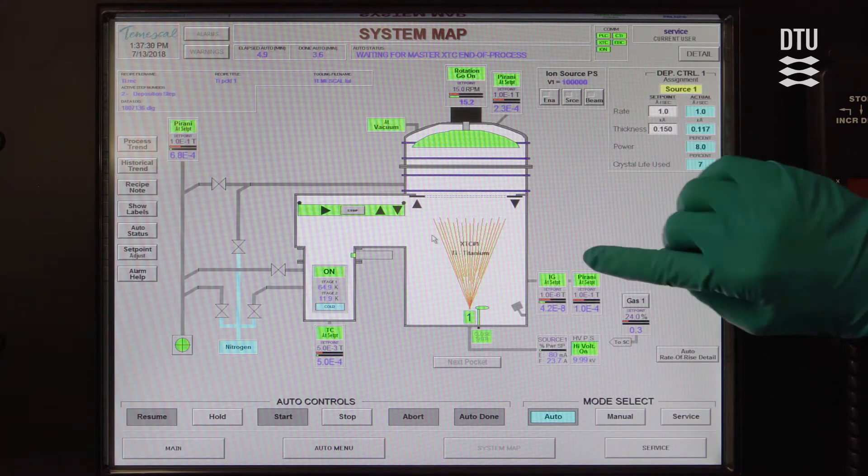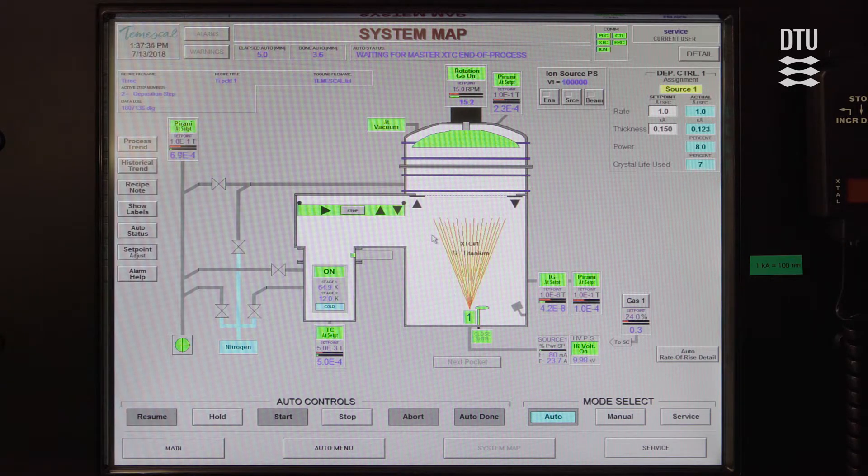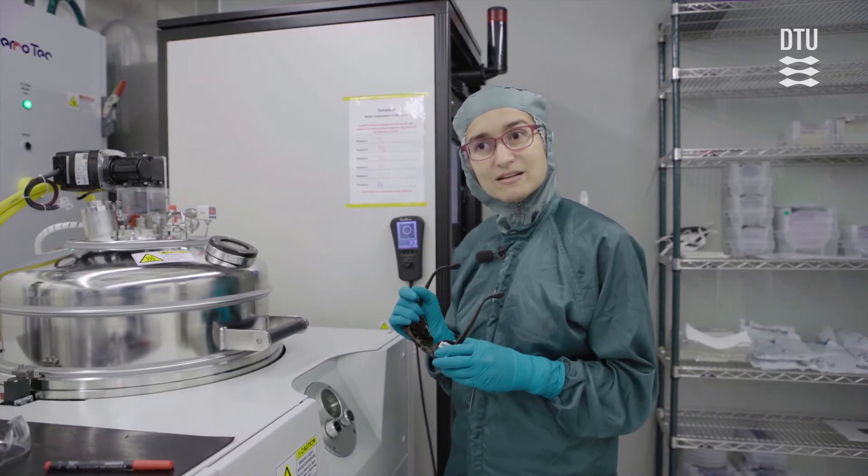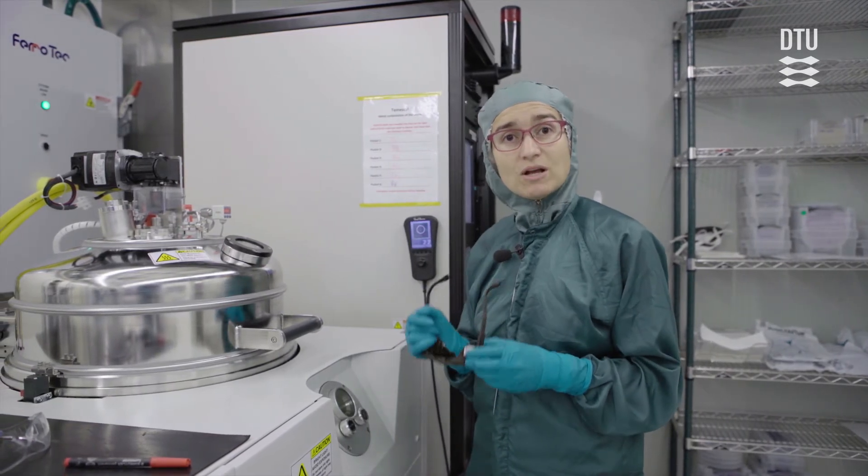And apart from checking the pressure, you should also check of course that the source looks right. You should actually look inside the chamber and see if it looks the way you expect it to look. And do that at the beginning of your deposition and if you're doing a long deposition of more than 100 nanometers, please look approximately every 100 nanometers of deposition. Be careful of your eyes when you're looking at the source because some materials like titanium become extremely bright.